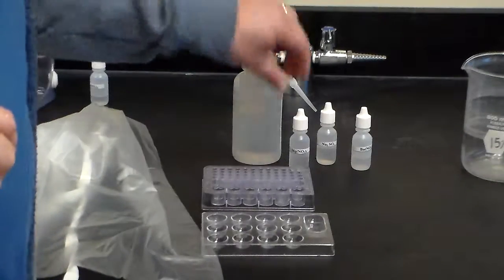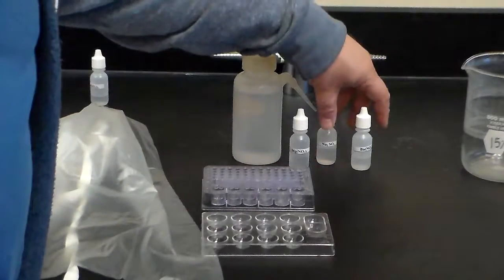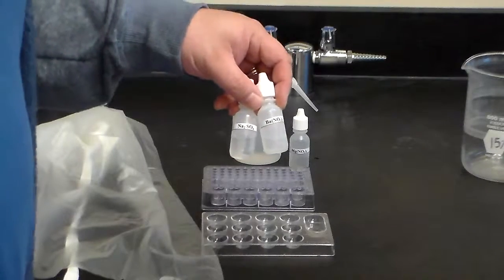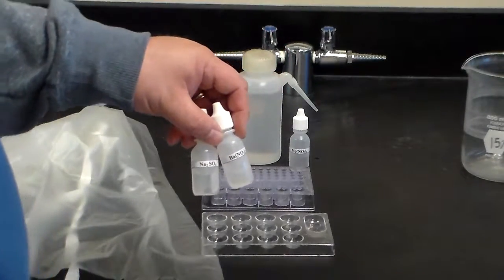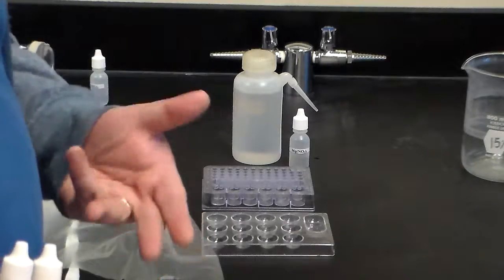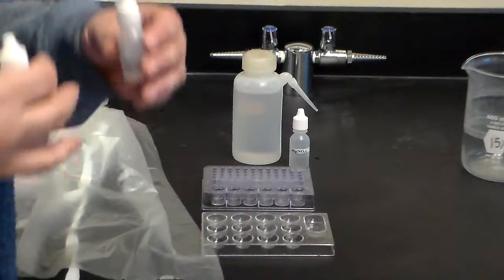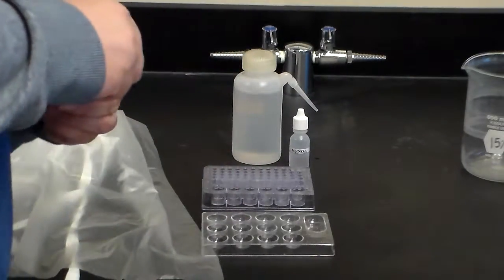Now, how do we go about this? You are going to get 2 bottles, and you're going to only work with 2 bottles at a time because there's not enough bottles to go around for every single group. You're going to conduct the tests. Unless you're in honors chemistry, where you're going to use solubility rules to predict which 2 chemicals combined together will form a precipitate. So let's go with it.